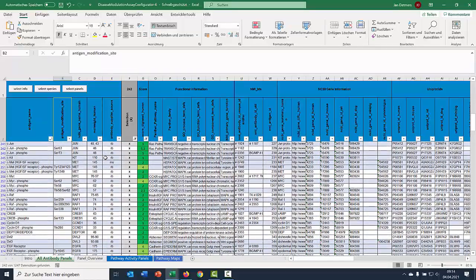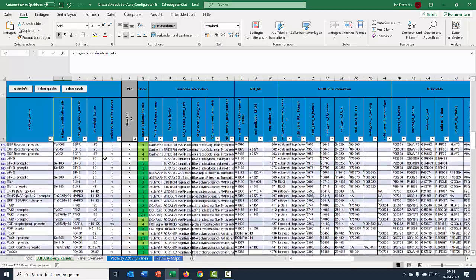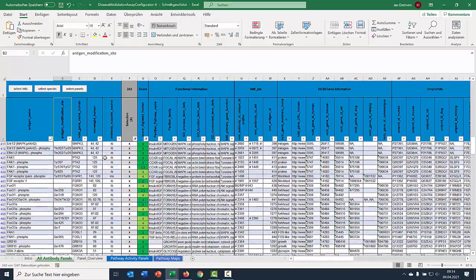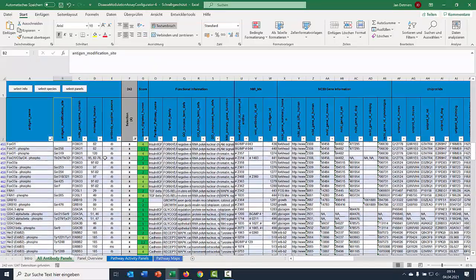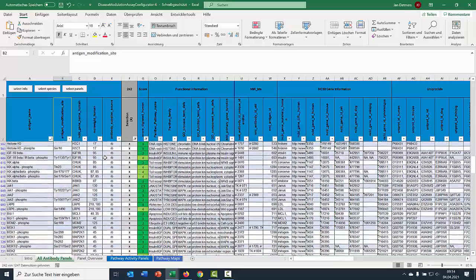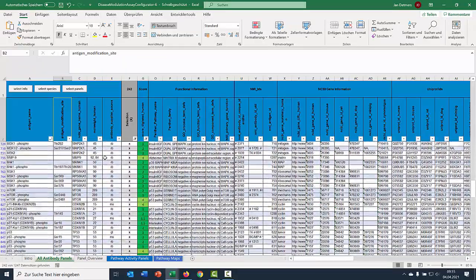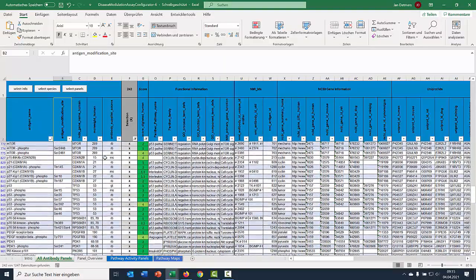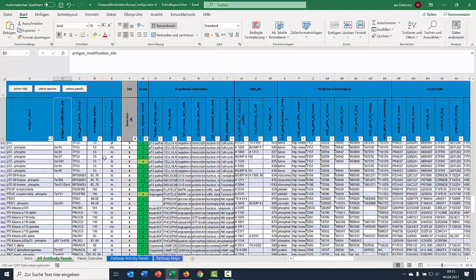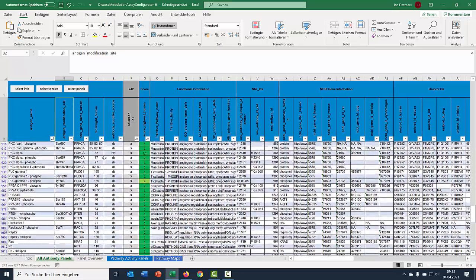The Hyperplex platform helps you quantify target interactions, pathway modulation and disease modulation. Does your drug candidate interact with the target? What are the downstream consequences of the drug-target interaction? Within 2 weeks of sample receipt, Assay Engineers Service Laboratory will provide you with a comprehensive, actionable overview of the relevant activated markers and pathways.